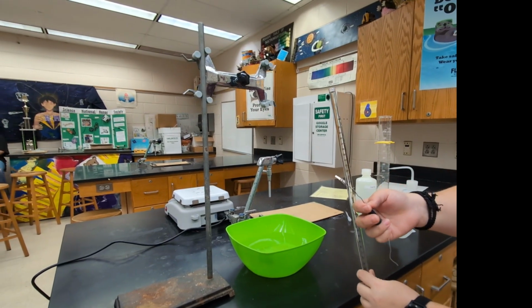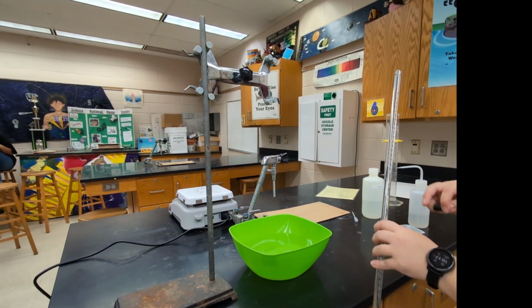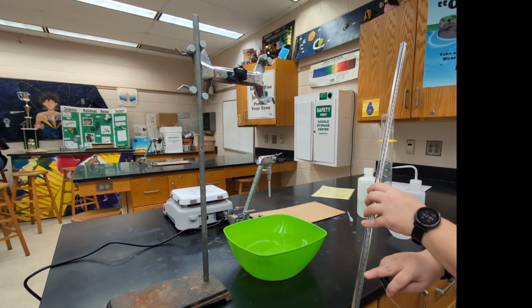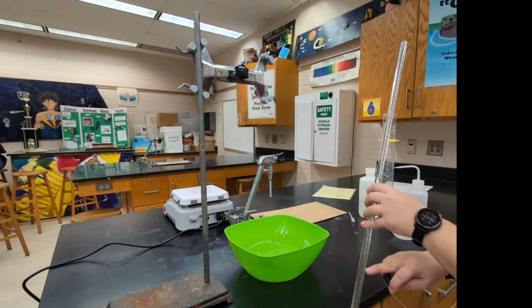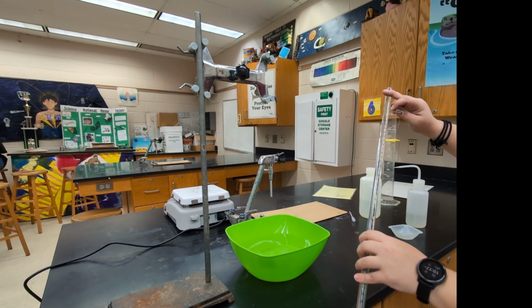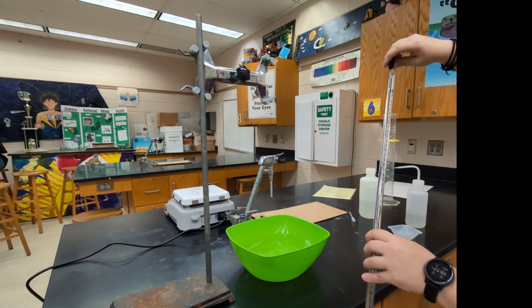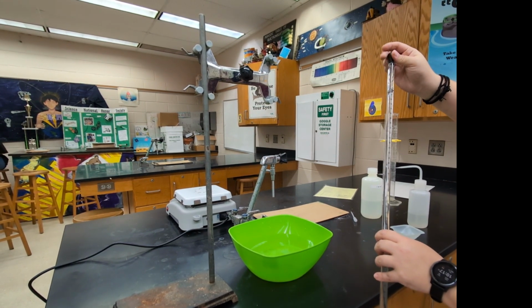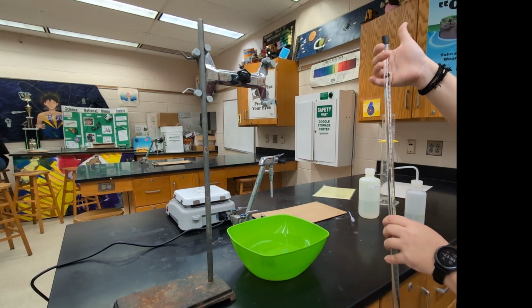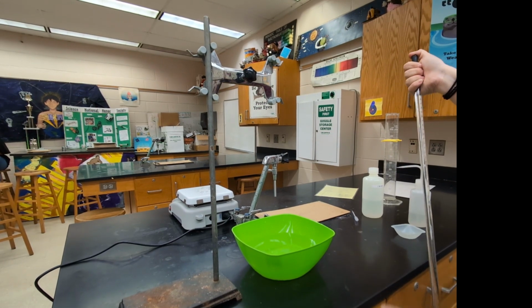So I've tied the magnesium metal in the top part of that copper wire, and I've put 7 or 8 milliliters of hydrochloric acid. It doesn't matter the exact amount, remember, because it's our excess reagent. And then I filled the rest of this with deionized water. Now I'm going to submerge this into the water and get a really nice and tight seal. And then I'm going to cover it with my thumb and submerge it in the bucket of tap water.